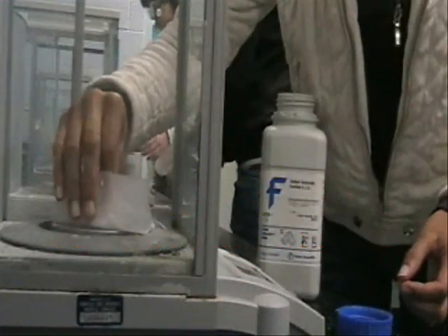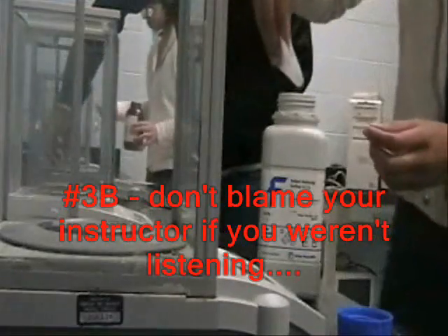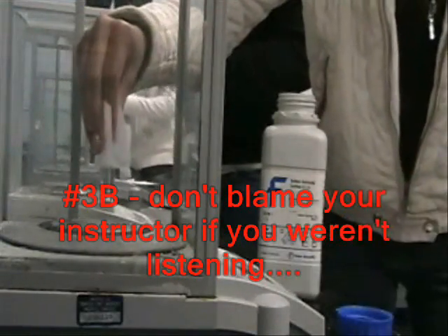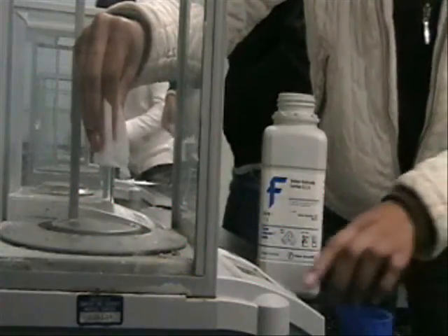Juella might have confused me and himself. The second thing you do is make sure your measurements are correct. That's pretty strong right there. I know.